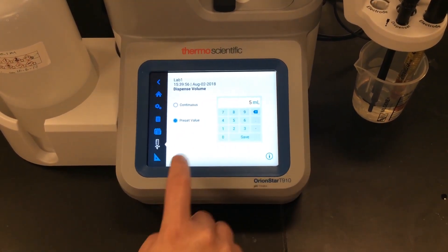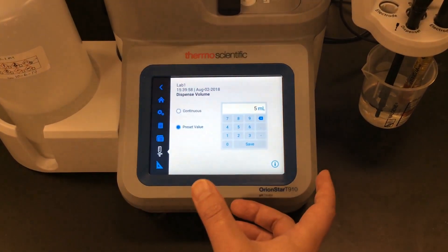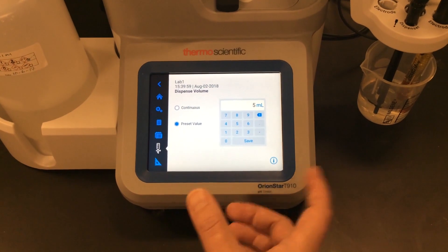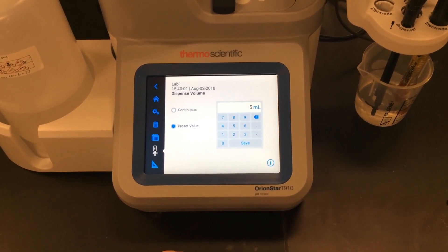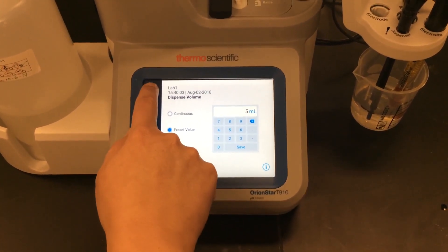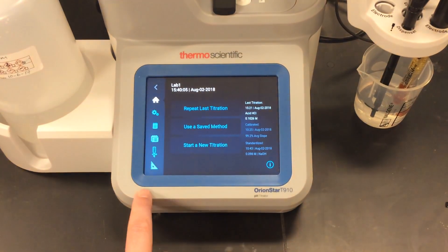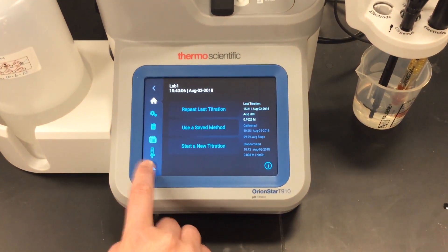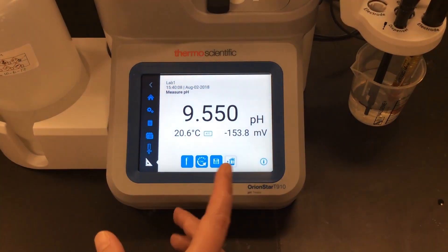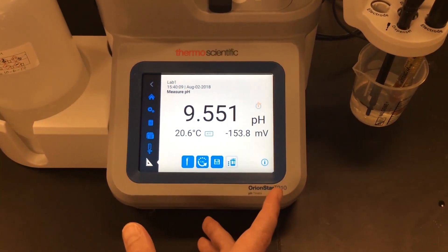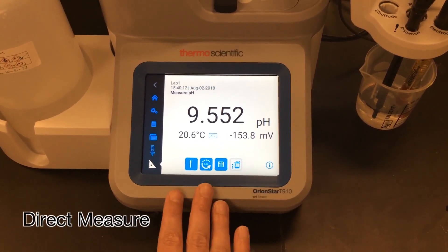I can use continuous dispensing in case I see an air bubble in my lines, or I can select a preset value and dispense five milliliters five times to make sure that my dispense accuracy looks good.